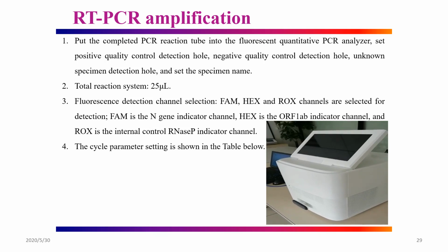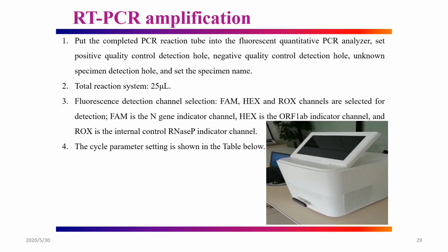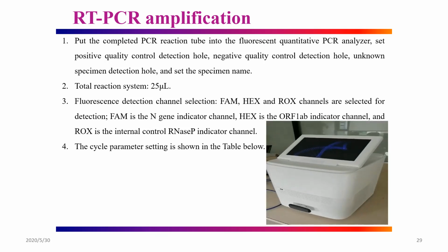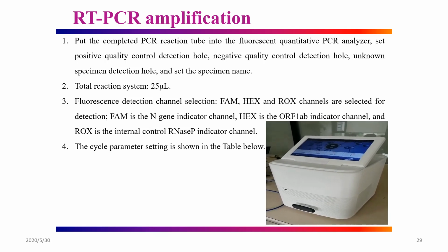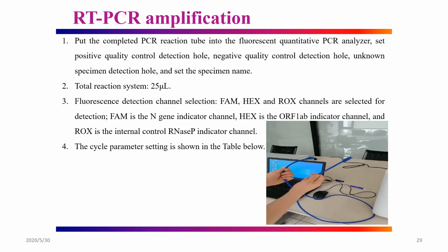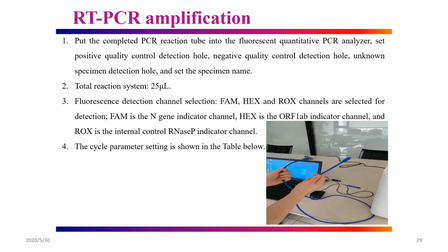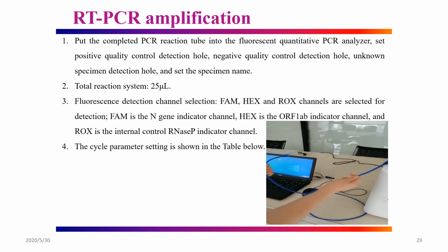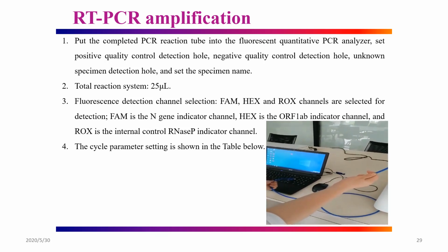Thank you for purchasing our real-time PCR system. First of all, please turn on the machine. You can find this cable in the carton and connect the instrument and computer with this cable.